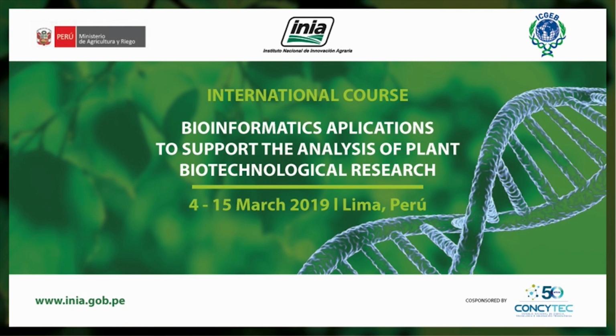How to design a proper experiment, at least from my part, in RNA-seq, differential gene expression, which David doesn't trust at all. And David is going to show you how to use the same information in network analysis, which I don't trust. But these are different ways of treating the same data, and we're going to show you how to do it.